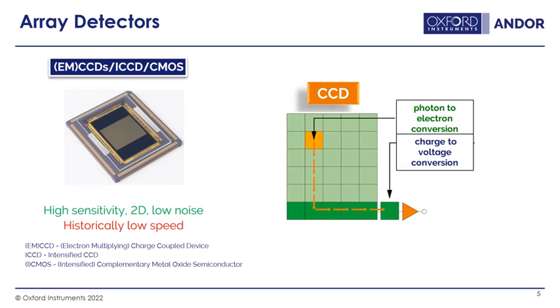Over here I'm showing a CCD where you have a collection of photosensitive pixels in light green, and down on the bottom in dark green you have the readout register. What happens in a CCD is when light strikes a pixel, it can generate an electron in the pixel by the photoelectric effect, like we just talked about. Then a voltage is used to take the electron from the pixel and bring it down to the readout register, where the electron is converted from a charge into a voltage, and this is what generates our signal.